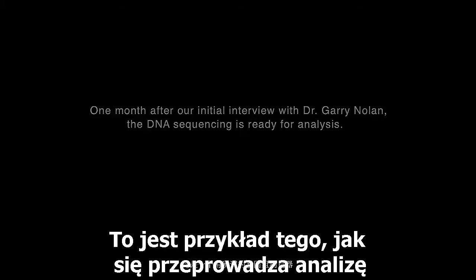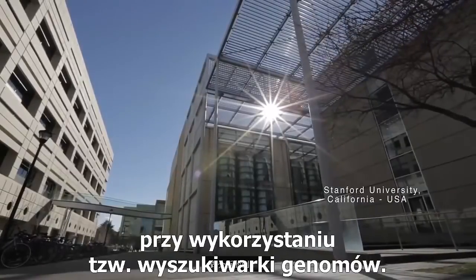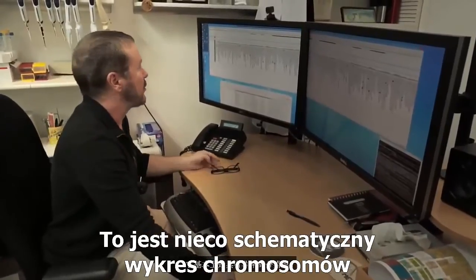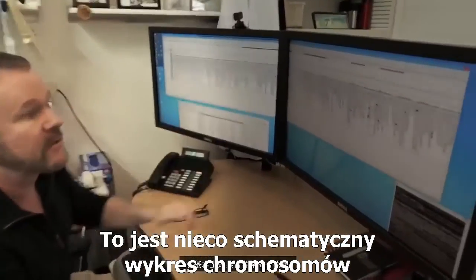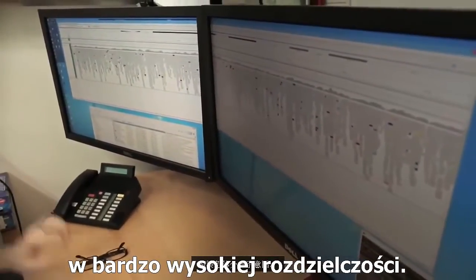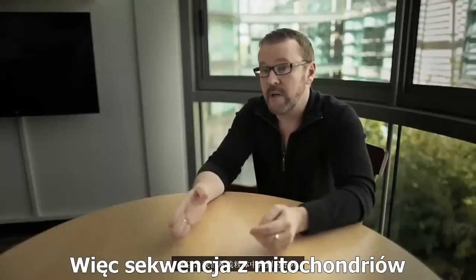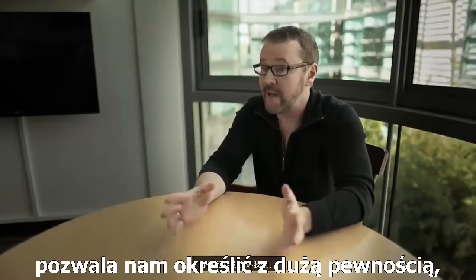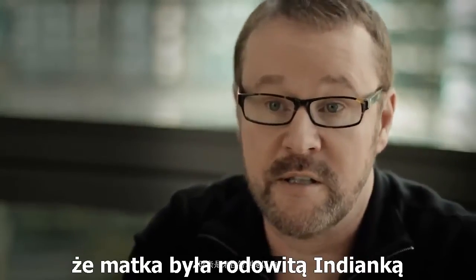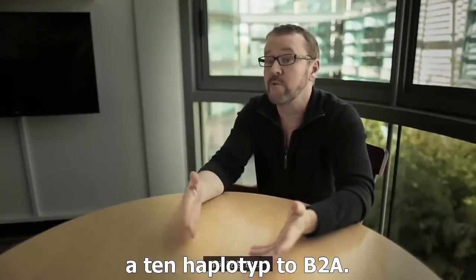So this is an example of how the analysis is done using what's called a genome browser. It's more or less a schematic representation of the chromosomes at a very high level of resolution. The sequence that we got from the mitochondria tells us with extremely high confidence that the mother was an indigenous Indian from the Chilean area, and the haplotype is called B2A.